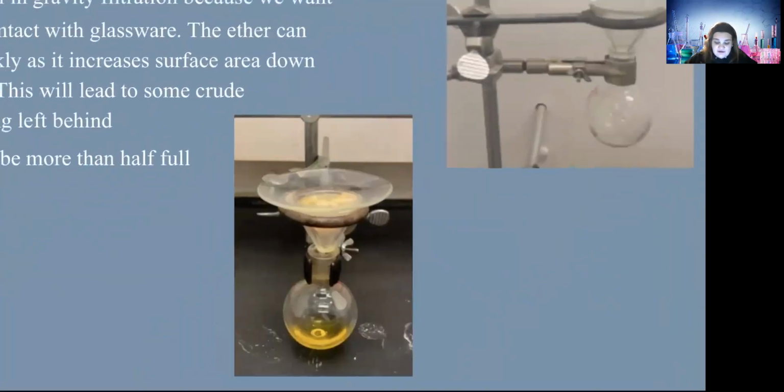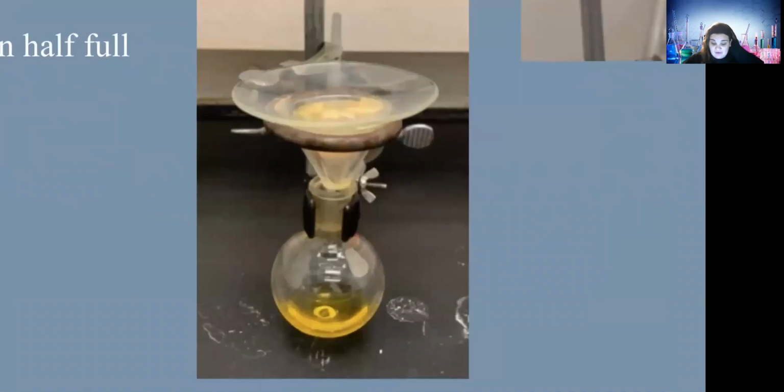And then down here, you'll see that this is the setup once we have some of the reaction occurring, okay? Here we see the watch glass on top. You can see that there's some yellow on that filter paper. So that's all that nutmeg, right? The nutmeg is being trapped in that filter paper, and we're trying to let the trimyristin, along with any soluble impurities, fall through, okay?